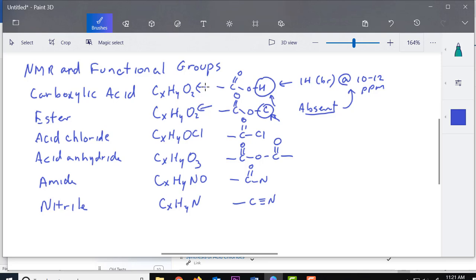In the case of an acid chloride, it's going to be fairly obvious you have an acid chloride because you'll have OCl as part of your molecular formula. That means that automatically you know that this will be part of what you'll put down as your functional group in your answer. So I would write that down first, is what I would do, and then build off that.